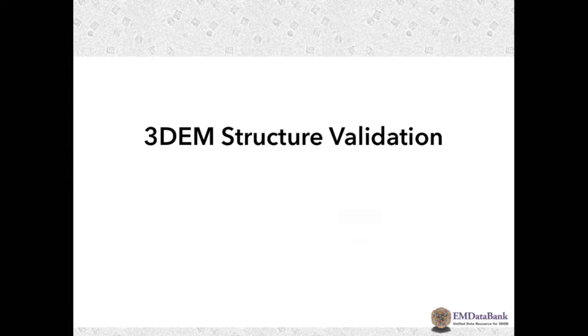And so it's really important to be able to provide some validation statistics. And then here's another reason why it's useful to have good validation. Just as a field, you want to be able to have some kind of mechanism to ensure yourself that you're not leading yourself down the wrong garden path to an incorrect structure, which I think the field has pretty well roundly declared that this particular structure that was published in 2013 is just not correct at all.